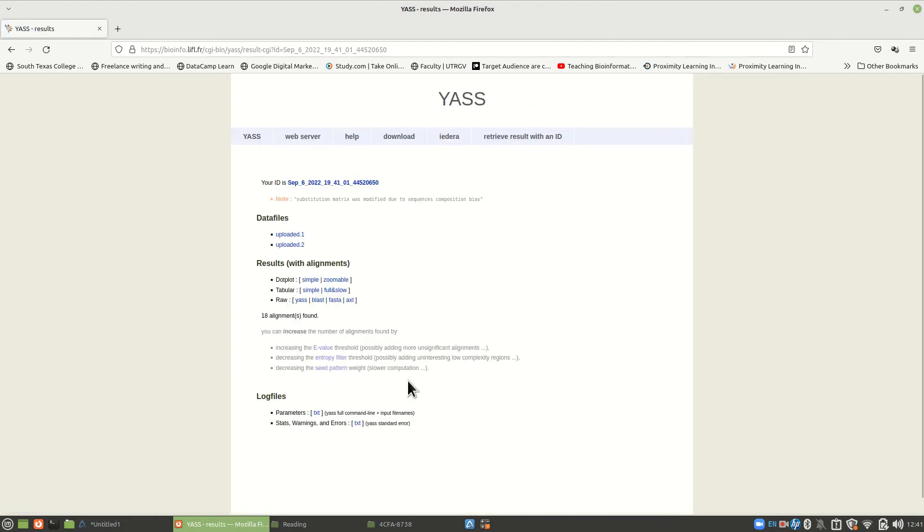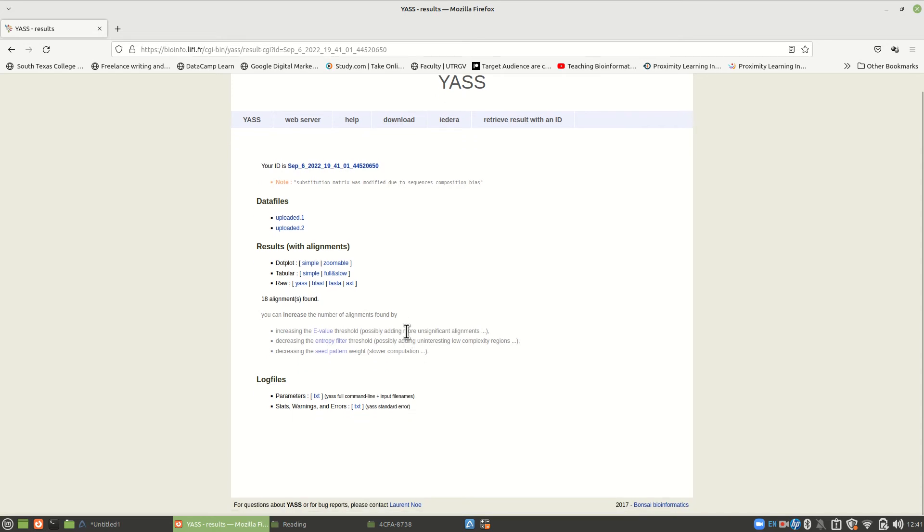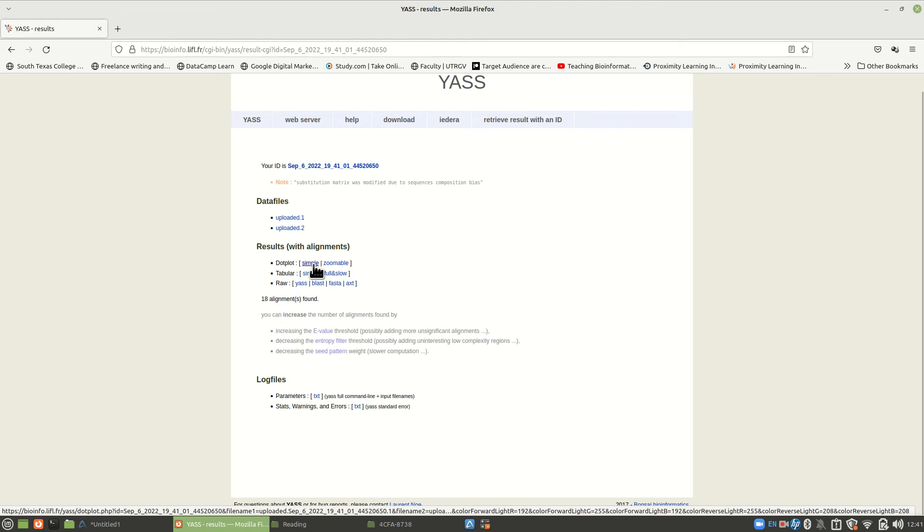All right. And here is the page that we get. This is a relatively quick program. So notice it gives us a dot plot, tabular, and raw. So that's kind of interesting. We get a dot plot with it. So let's look at our simple dot plot.